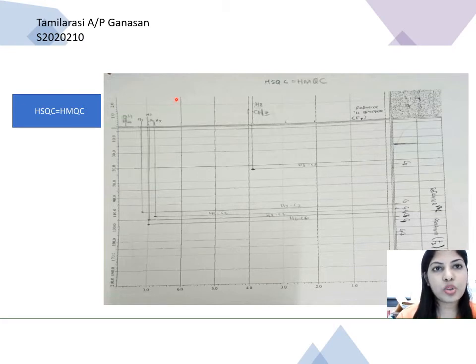If we look at this HSQC spectrum, by tracing across the x-axis, which is proton, we are able to correlate one of these proton signals with something on the y-axis, which is the carbon 13 spectrum. The two spectra we are correlating between are not the same.